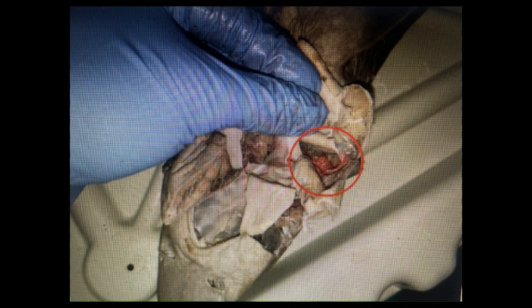When a shark needs to get rid of waste, it utilizes its kidneys, genitals, the cloaca, and gills. The cloaca is an opening that the kidneys and genitals empty into.